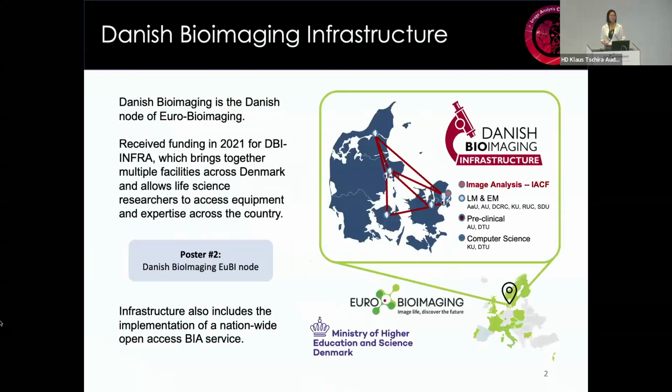You heard this morning from Thomas from Danish BioImaging, and Danish BioImaging is the Danish node of Euro-BioImaging. We received funding in 2021 from the Ministry of Higher Education and Science to bring these multiple facilities across Denmark and allow life science researchers to access equipment and expertise across the country. This infrastructure supports communication between these different open access facilities. We have a facility access portal, a website where you can see all the different facilities, what resources they have, and how you can get in contact with them.